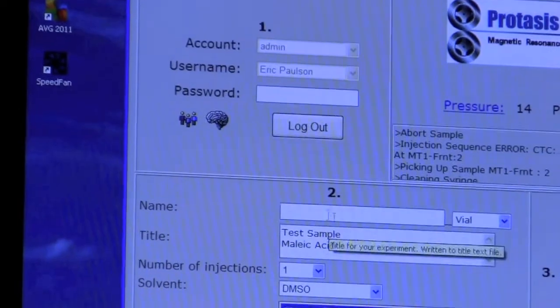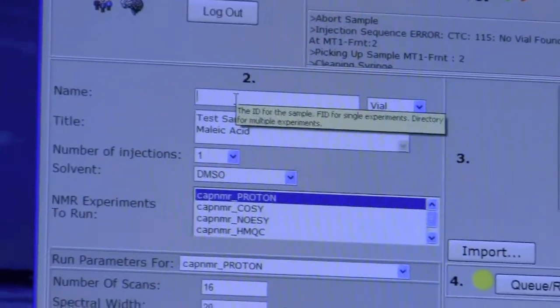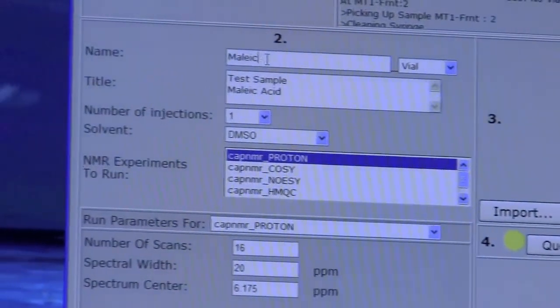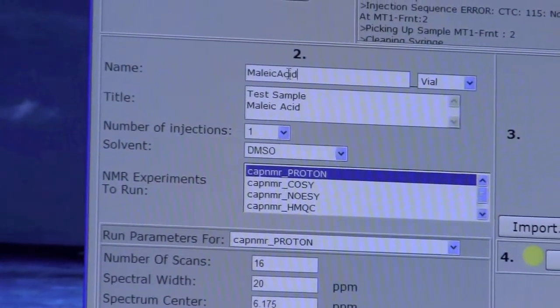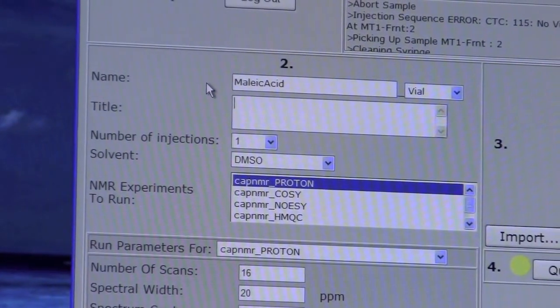And then number two, you want to put in the name. This name is saved to disk, so you should not use any spaces or funny characters. And then put in the title. This is the title that gets saved with your data, just like in IconNMR.